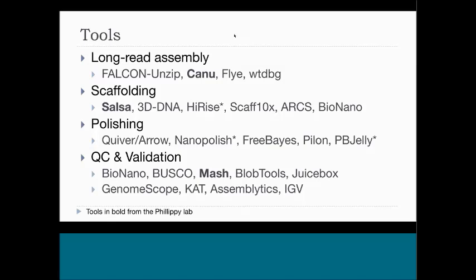Well, I'm a big advocate of trying to always collect enough long read data to be able to create the assembly itself just from the long reads rather than trying a hybrid approach. It's my opinion that the quality of those resulting assemblies is quite good. If you're very cost conscious, there are approaches that can combine short reads with long reads, but I always find it easier just to spend a little extra money and get enough long reads. So typically I would say 60x coverage of long read data. If you're very concerned and want validation with Illumina, then 30x of Illumina to be applied for validation or polishing after the fact should be good.